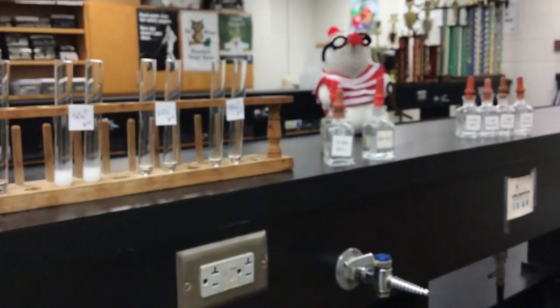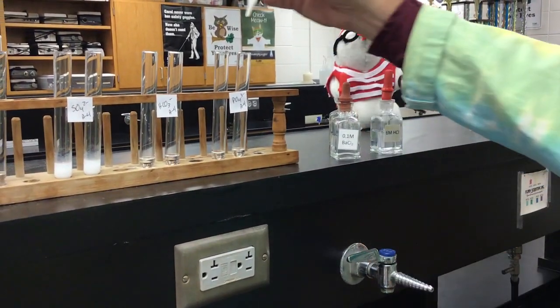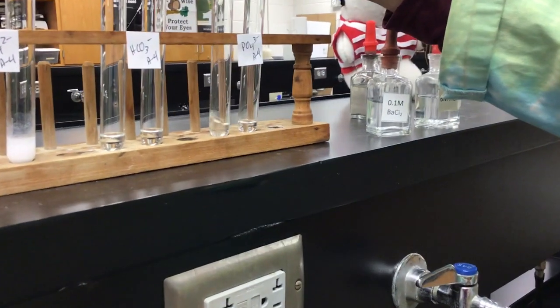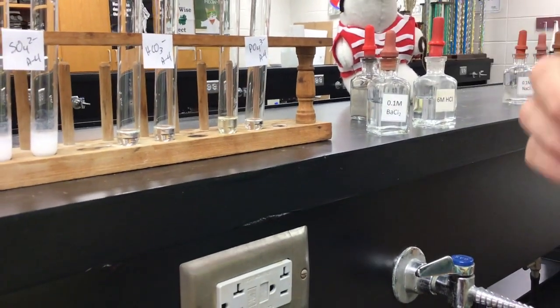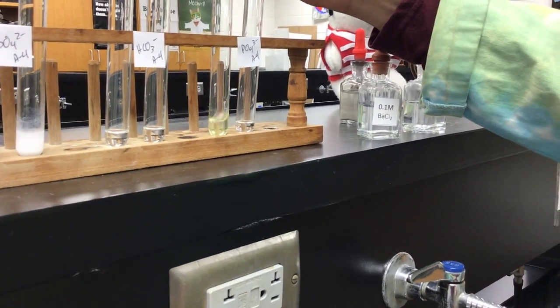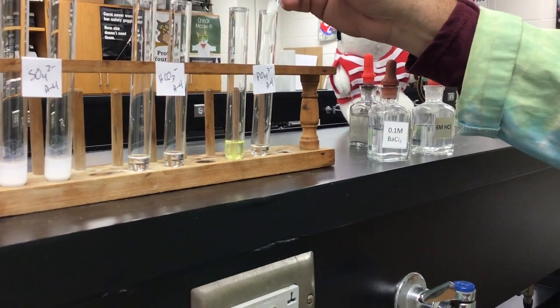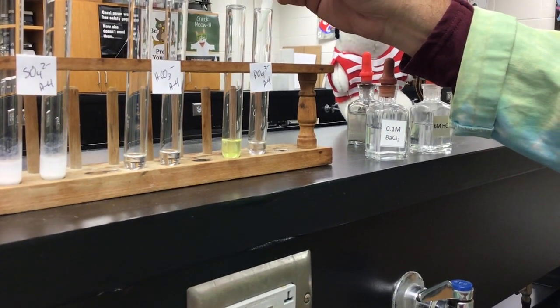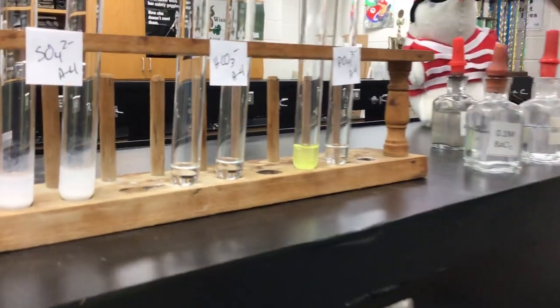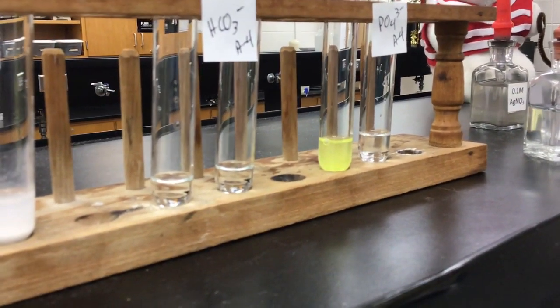And the last one, we'll be testing for the presence of the phosphate ion. So you'll look at your known and see if we get that in our unknown as well. And we'll add it to our unknown. And there we go.